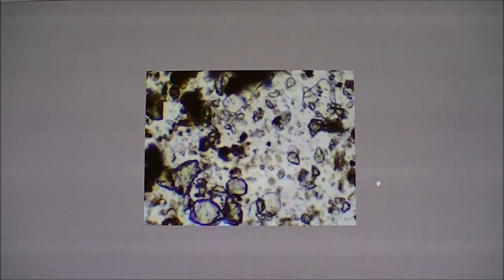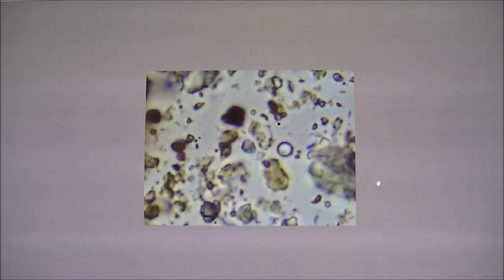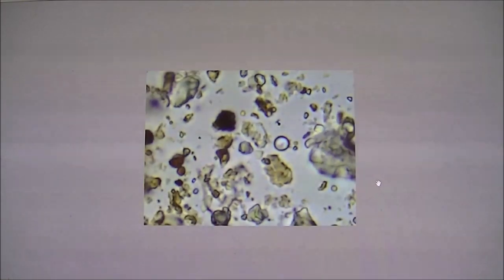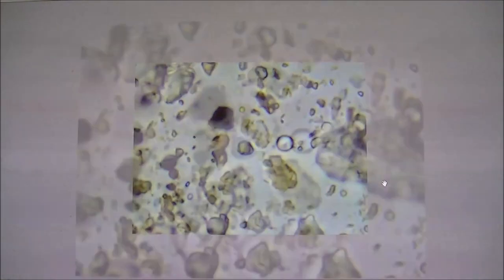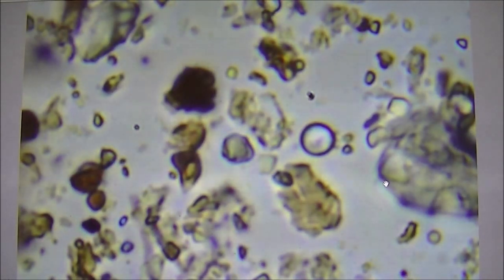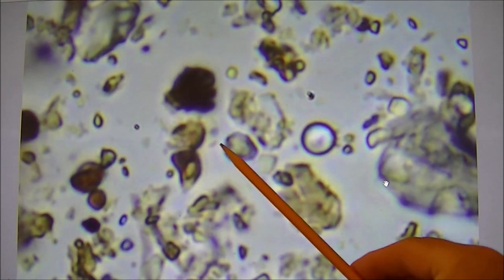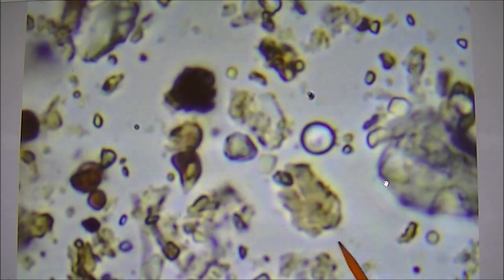Okay, this is our first look here, looking at our worm castings from the bin. This is only 100 magnification, let's go to 400 and readjust. We'll just focus in slowly so the camera can see. Now what you see moving around all in the background here, there's a little bit of shadowing because it's layered. All this here is bacteria moving around, so we have lots of bacteria still feeding on those worm castings.